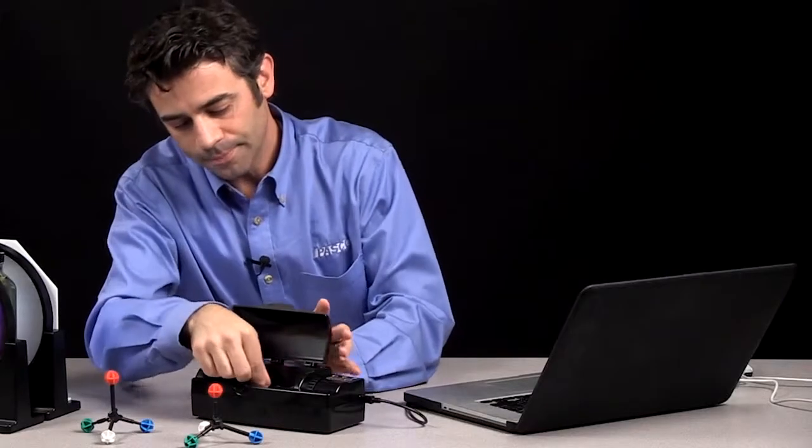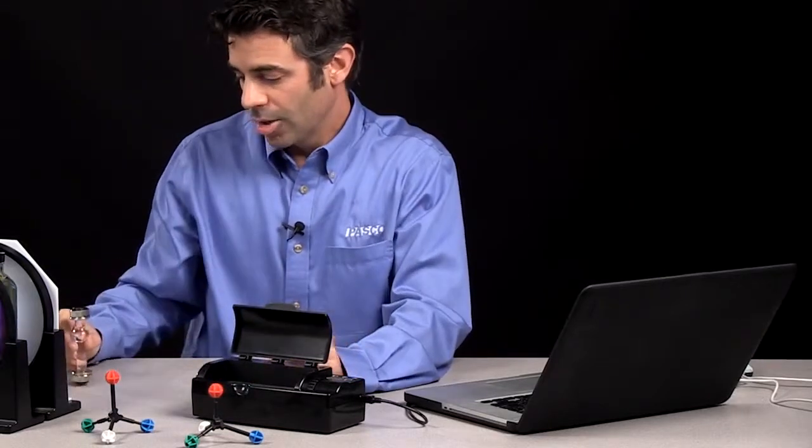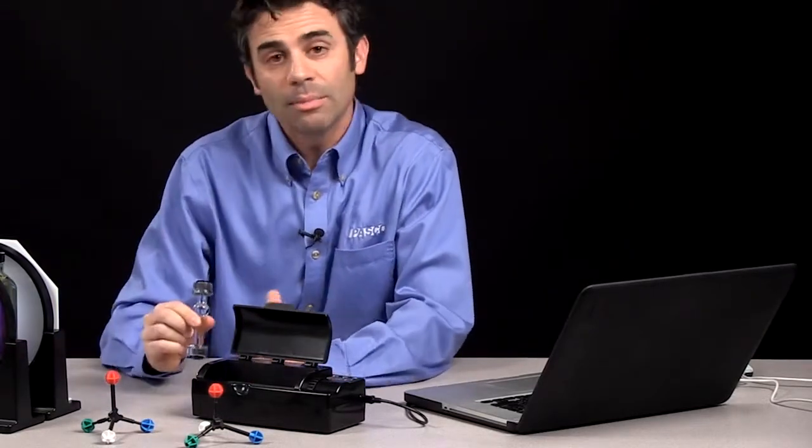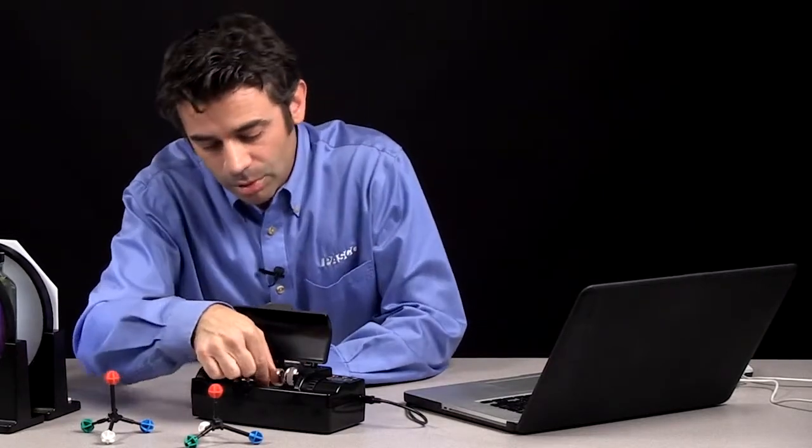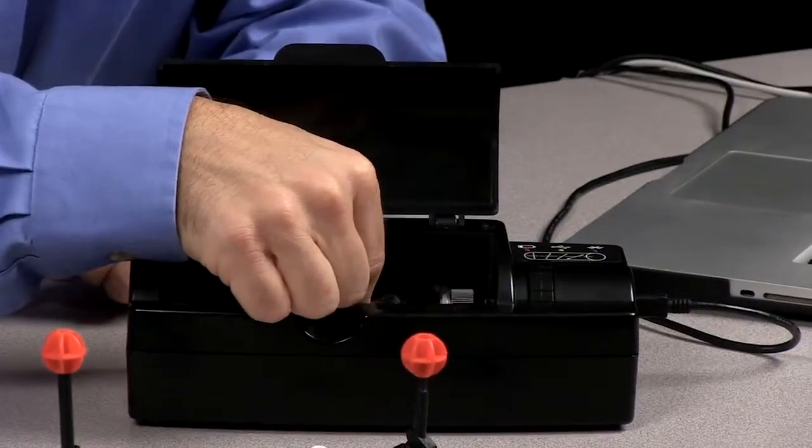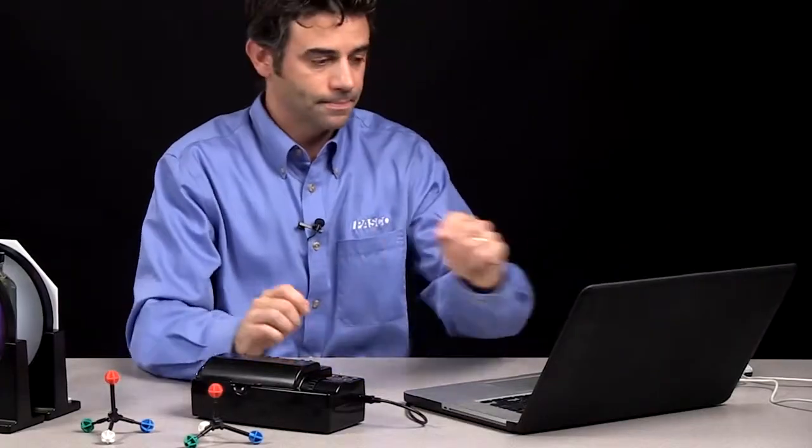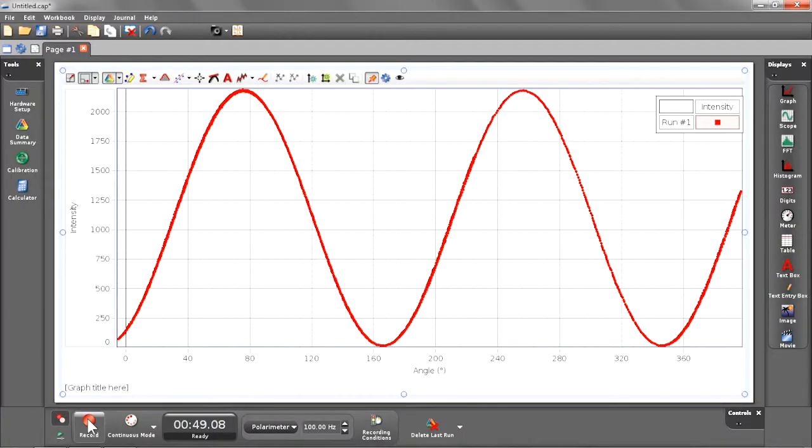So now I'm going to take this sample out. If you're doing this as an actual experiment, you probably want to use the same sample holder each time. But for this purpose, I'm just going to use a different sample holder. I'm going to put this in. And this has a sucrose solution in it. So I'm going to start recording again.